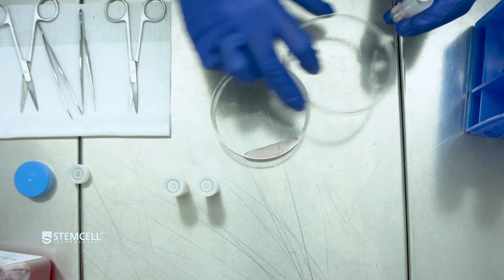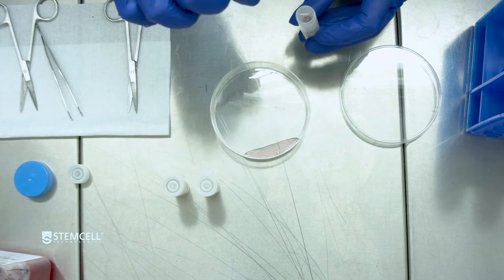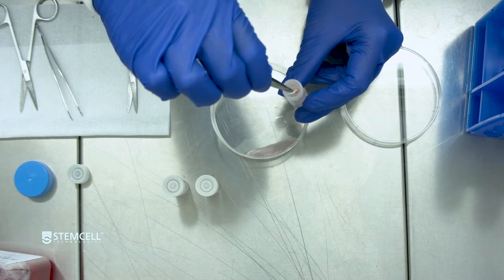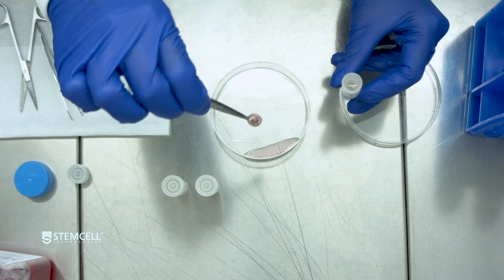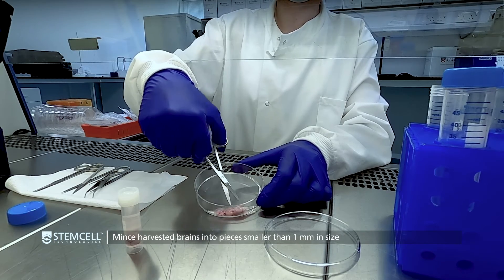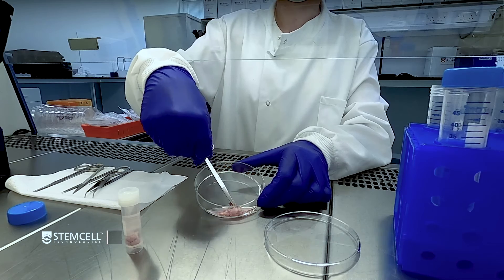Add at least one milliliter of brain digestion medium to a non-treated tissue culture dish. Transfer freshly harvested brains to the dish and mince into pieces smaller than 1 mm in size using a sterile scalpel, razor blade, or scissors.